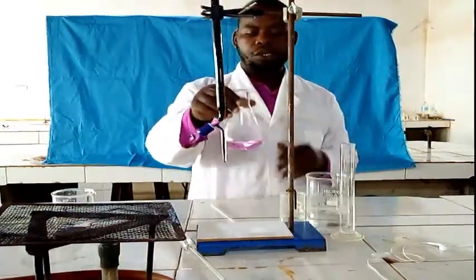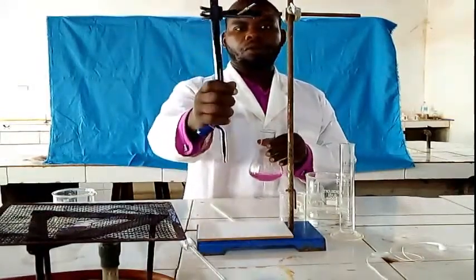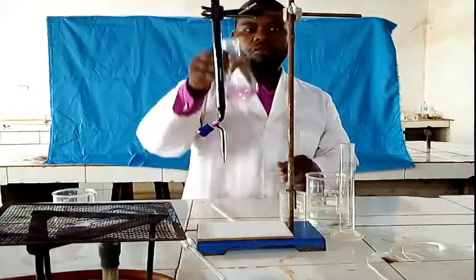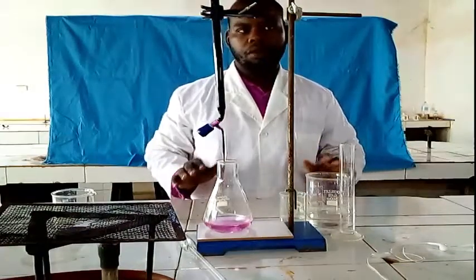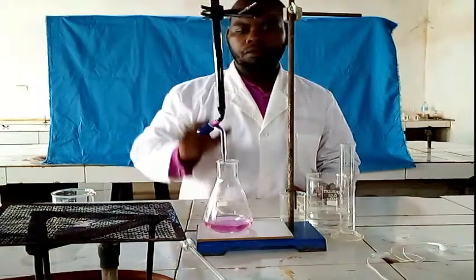So, from colorless to pink. Why is it pink? There is an excess of permanganate in our solution. So that's why it is pink. And this potassium permanganate is a self-indicator. That's why we don't have any other indicator besides this one.